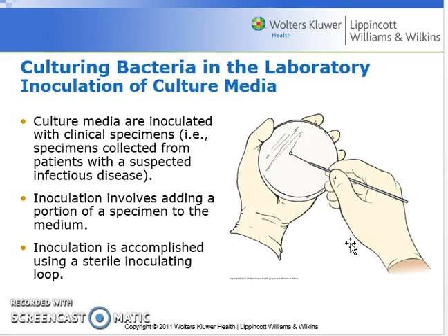If you're working in a clinical laboratory, you might have a sample of sputum taken from a patient, and you may have to purify that sputum so you can isolate the bacteria that might be present in it. To do this, you can take a simple inoculation loop, take a sample of the sputum, and plate that on some nutrient agar media.